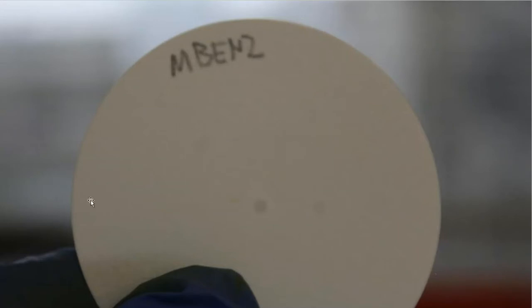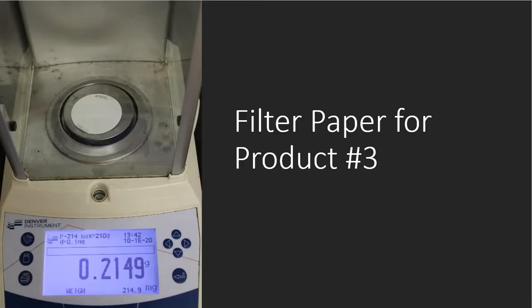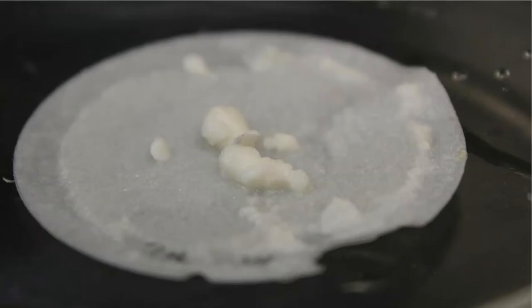Finally, methyl benzoate. I need that filter paper as well. So methyl benzoate filter paper is going to weigh 0.2149. And then as I pour that product through, I'm going to capture that crystal on my filter paper, and that's what I have left. Again, kind of pitiful. I mean, all of that work for that little smudge of stuff right there on the filter paper. Is it me? Am I getting rusty, or is that just the reaction? Who knows? We'll figure that out later.